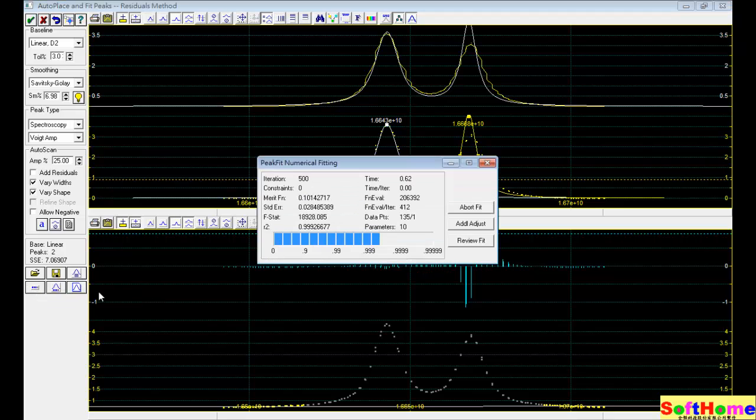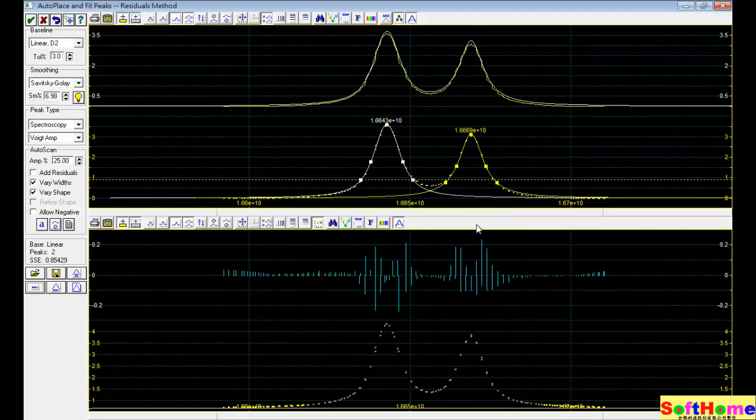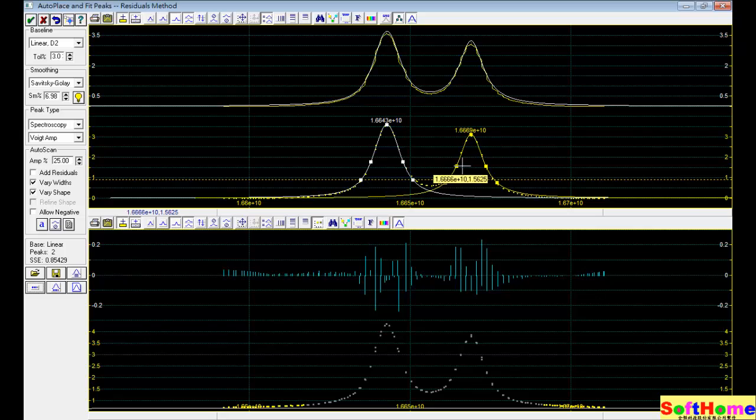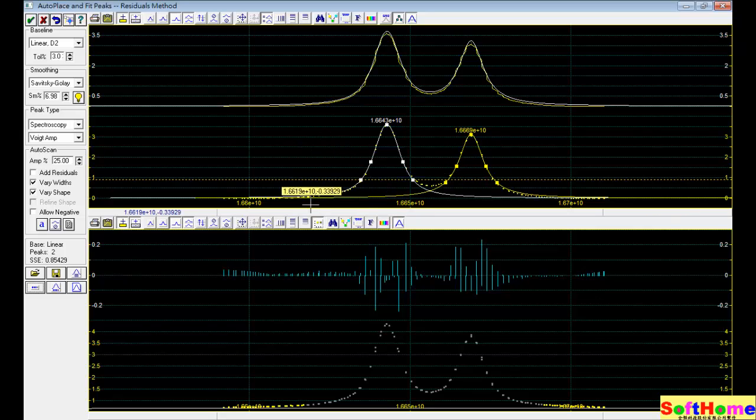With numerical update, and after first calculation, we adjust. And you can find very close to the original data.